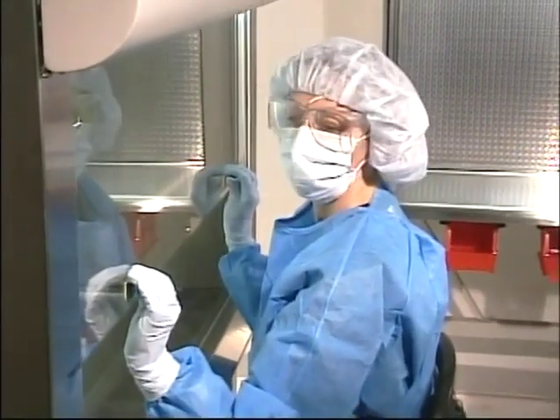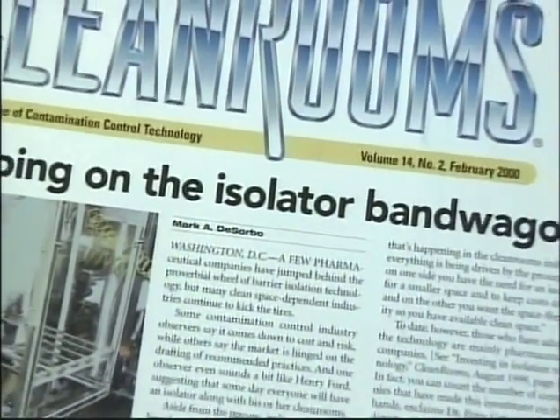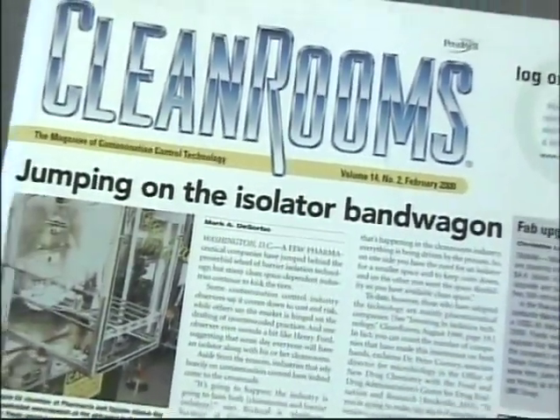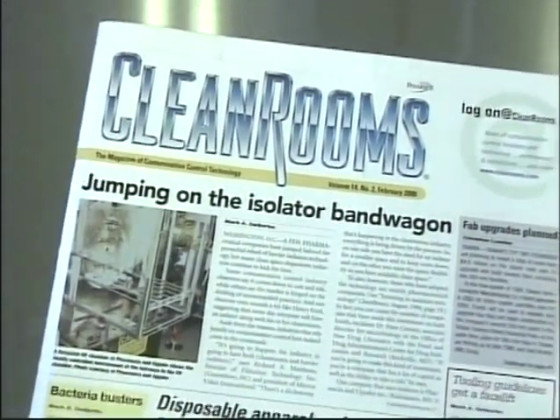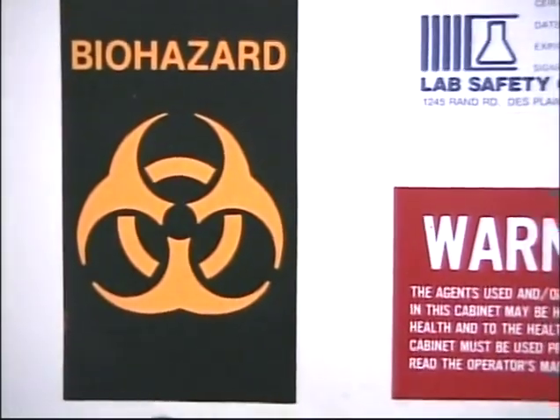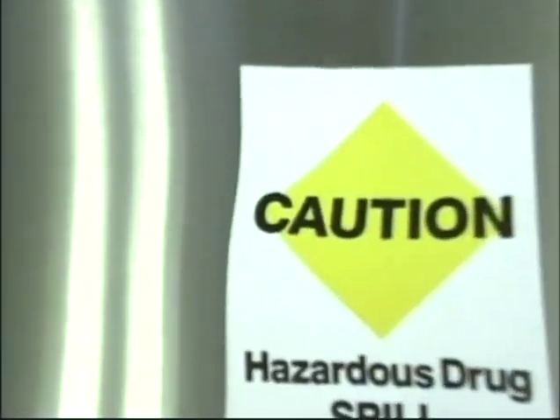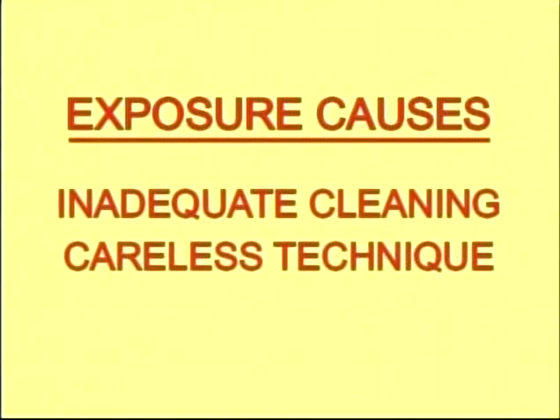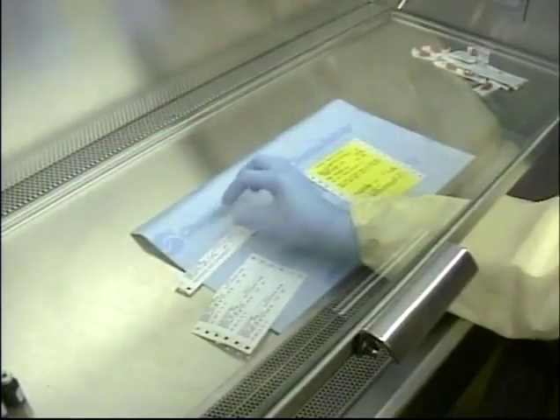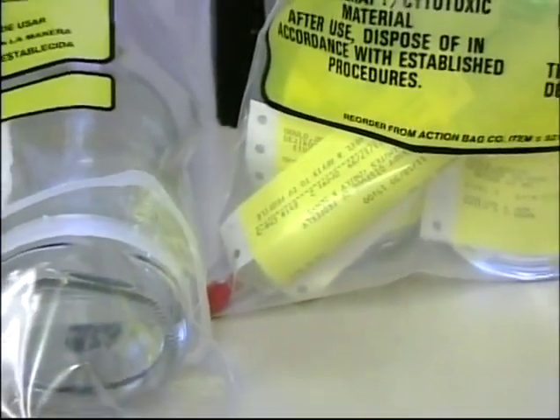Although the BSC does provide some protection and containment of hazardous materials, recent studies have detected surface contamination in pharmacy compounding areas and patient administration areas outside the BSC, as well as the presence of antineoplastic agents in urine samples collected from pharmacists, technicians, and nurses using BSCs and gloves as the minimum level of protection. There are several reasons for this, most related to inadequate cleaning of the cabinet and careless technique. Some of the contaminants are carried into the general area on gloves, restocked supplies, and product that is contaminated by sloppy technique.